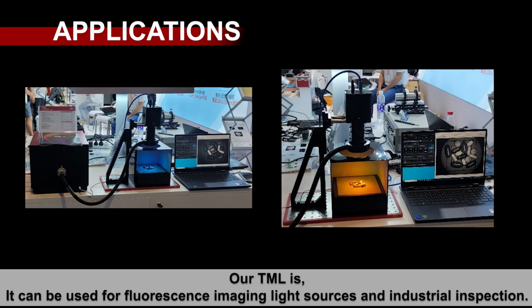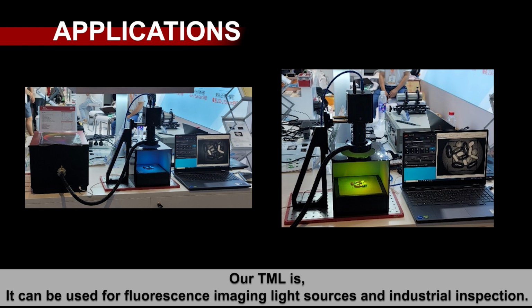Our TML can be used for fluorescence imaging light sources and industrial inspection.